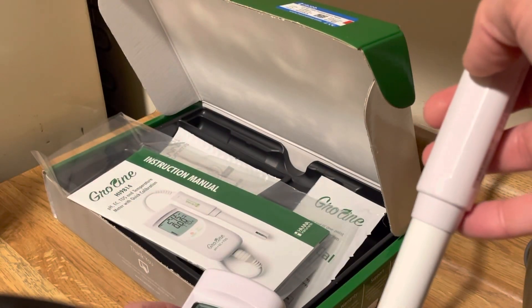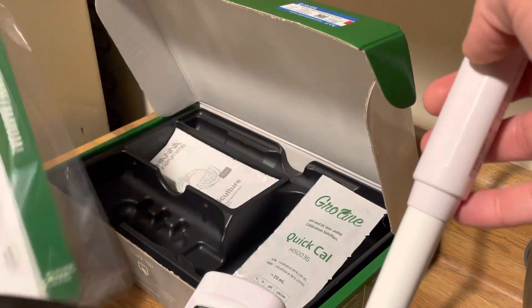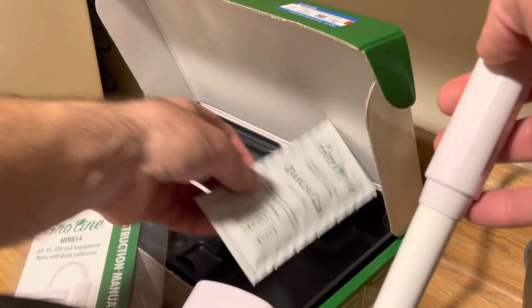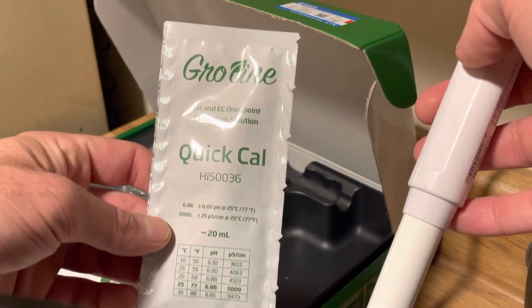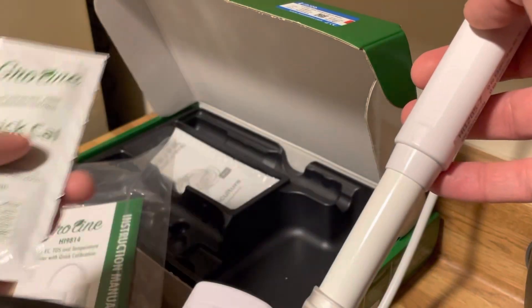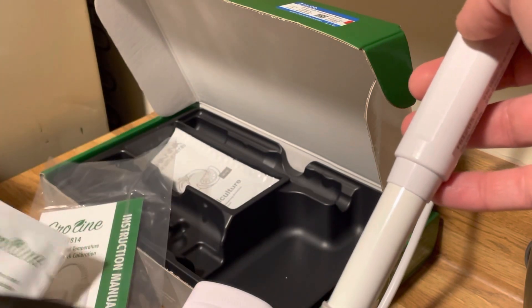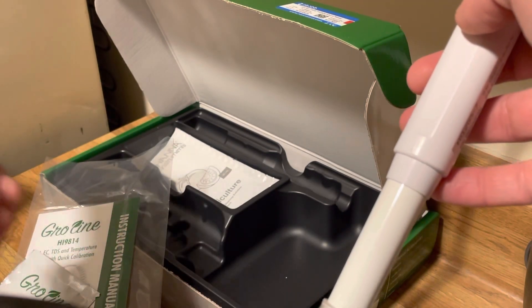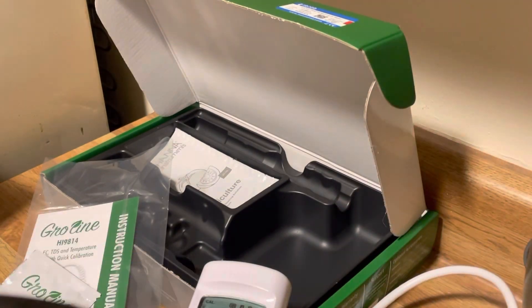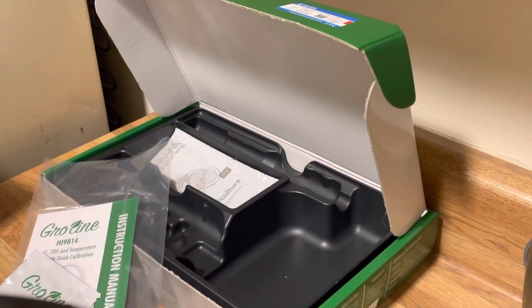Ideally you would calibrate even if it says it's already done. So I'll go ahead and take one of these Quick Cal solutions and calibrate this to make sure we're good to go. Let me just do it now while we're on video — I'm going to go ahead and rinse the head of this probe.